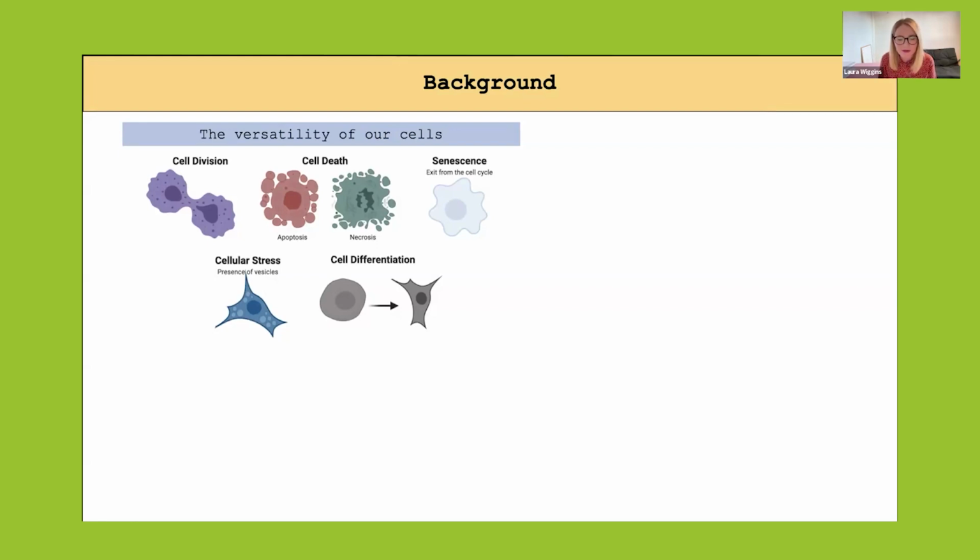But another thing that we can use to tell us about what our cells are actually doing is cell morphology and what cells actually look like. If you're a trained biologist or if you spend a lot of time working with cells, you've managed to acquire this ability to look at cells just on the microscope and instantly know whether they're healthy, what cell type they are, if they've responded to a drug treatment that you've put on. And the reason for that is that there must be something about how a cell looks, or metrics that our eyes are extracting from cells, to tell us about what cell cycle or what cell state cells are at.